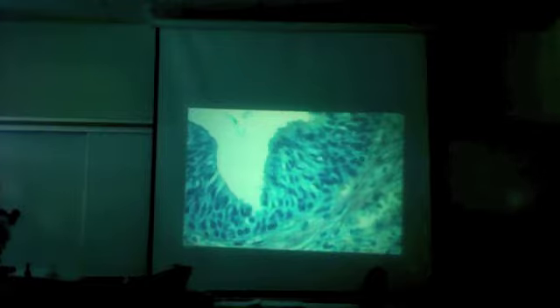And then here's the relaxed transition. Several layers thicker than the stretched out version. Lining the urinary bladder or ureter would work. Don't use urethra because there's not much of it in there, so for urinary bladder, ureter.